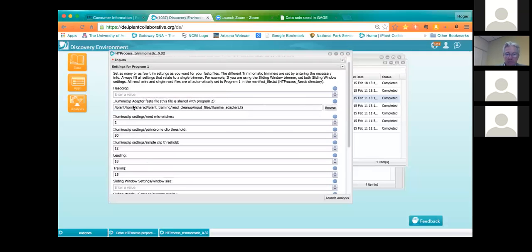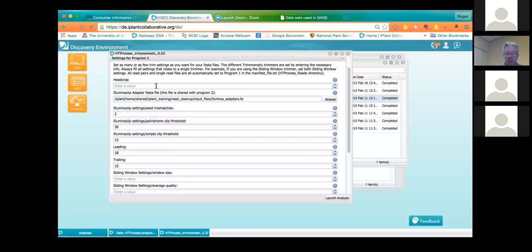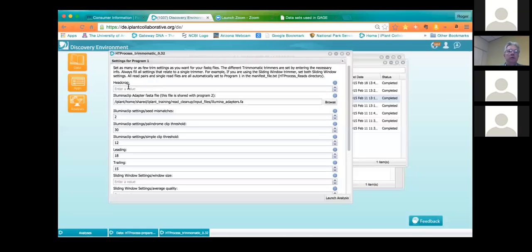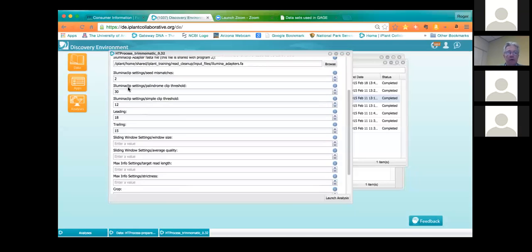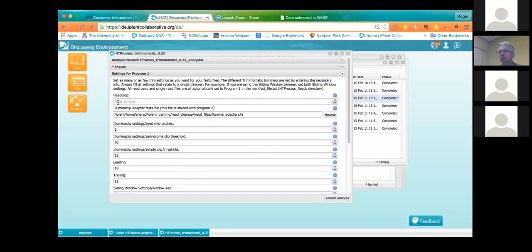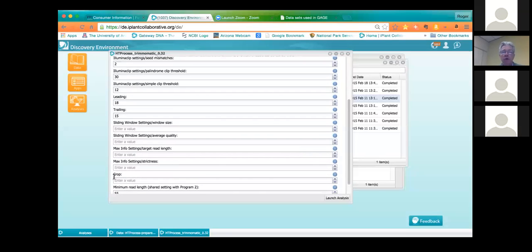Now, beside this Illumina clip trimmer, there's head crop, which trims the front of the read itself, and you can choose a fixed value to trim off. I can show you an example of when you may want something like this later. You can also use crop to do the same towards the end, but the difference is that for head crop, you enter how much you want to take off. For crop, you enter the value of what you want to leave behind.